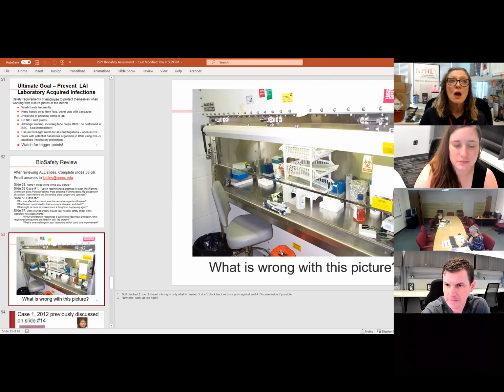So a good rule of thought here is that every time you exit that biosafety cabinet, you should be taking your gloves off first. So in reality, you should have it planned well enough that you have all the equipment in there, that if you've forgotten something, ask somebody to help you. The only time you go in is at the very beginning. Anything that needs to be disposed of, you should have a small disposal container in there.